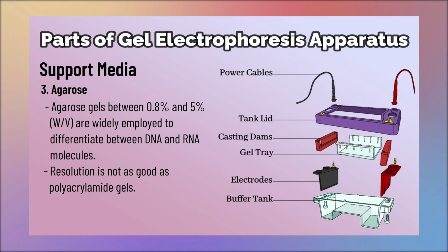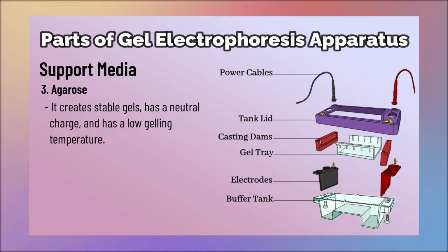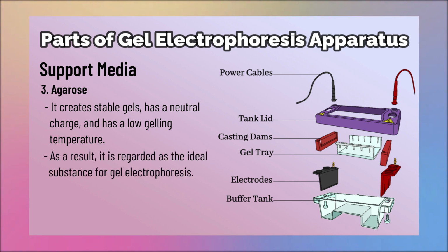Resolution is not as good as polyacrylamide gels. It creates stable gels, has a neutral charge, and has a low gelling temperature. As a result, it is regarded as the ideal substance for gel electrophoresis. It can either be liquid or solid.